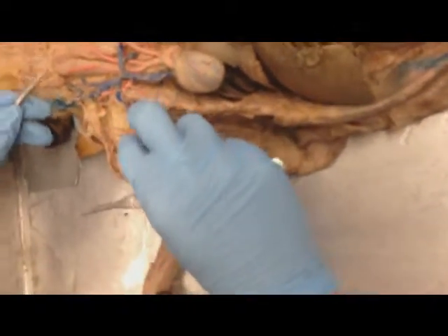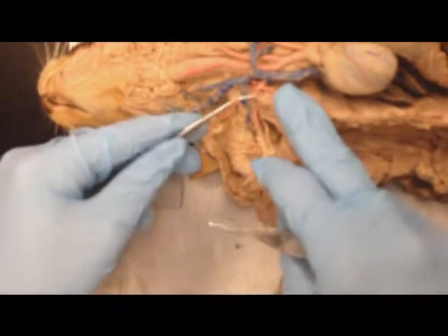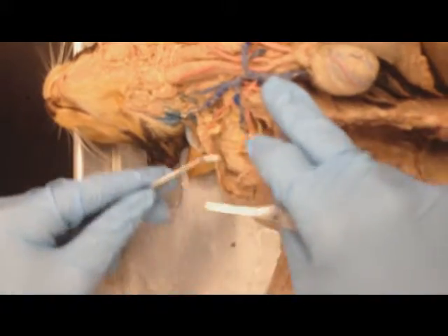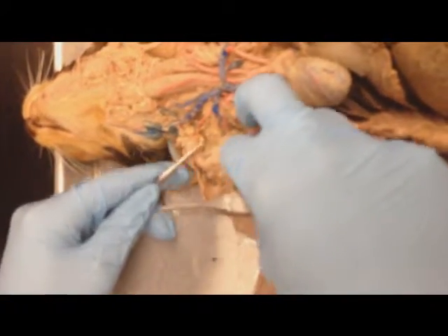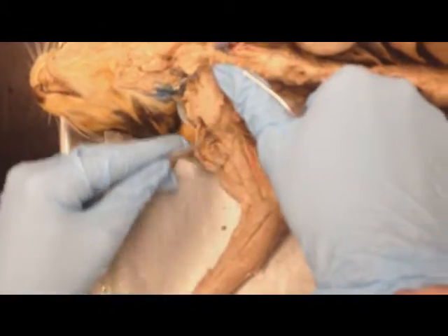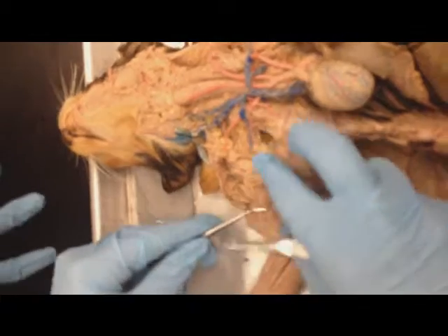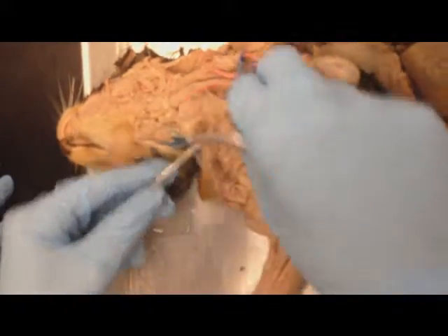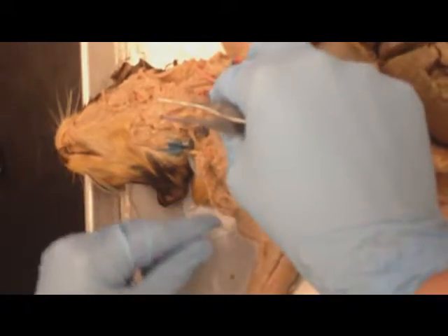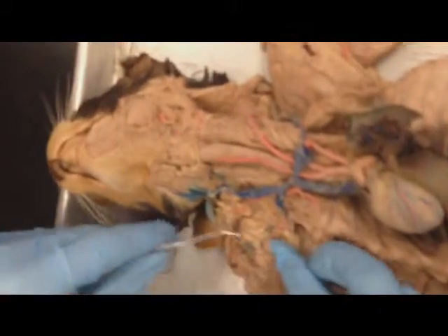So coming up the arm, let's see if we can find anything good. As you go up your right subclavian, it turns into the axillary region in the armpit. It's not a specific vein, it's just the axillary portion of the artery. And then axillary turns into brachial. And that happens at the anterior humeral circumflex. At brachial, or here the axillary portion, this cat's kind of difficult.